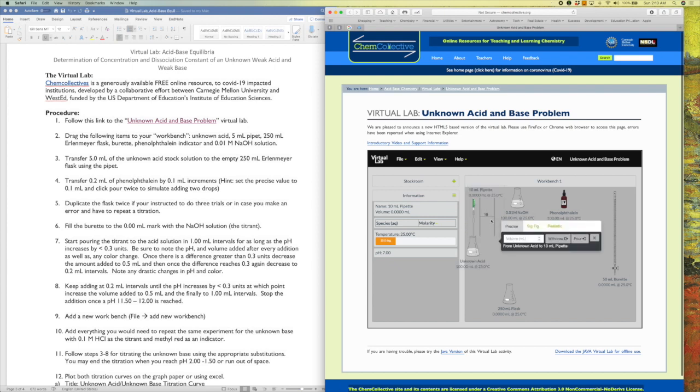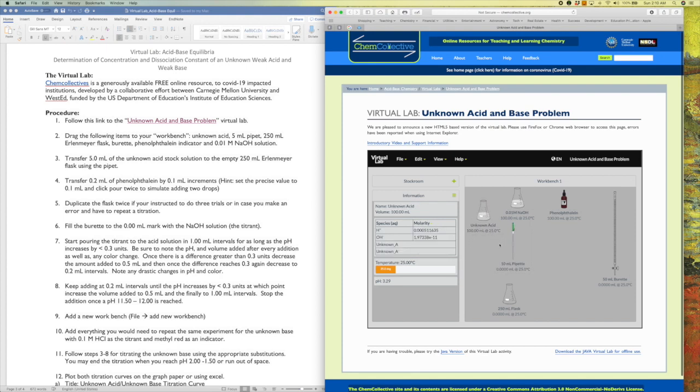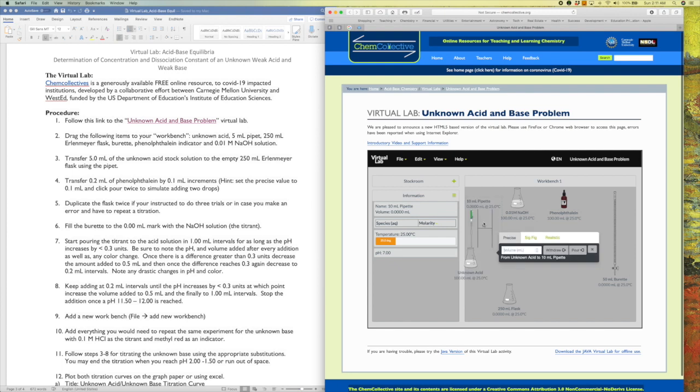And you'll see that when I've done that, you see that plus sign. That plus sign is showing that we're trying to use these two pieces of equipment together, right? So once it hovers over and you get that plus sign, you can let it go, and now you see that it's set up to work together. And a new window has opened asking us what volume we are either taking out, withdrawing, or pouring in. Now obviously we're going to be withdrawing from this flask, right?